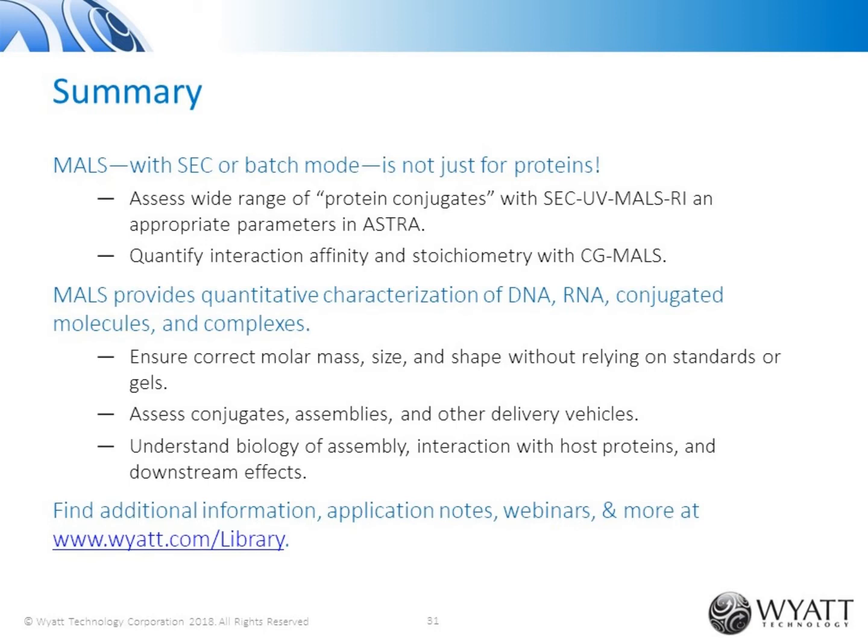We don't have that issue. So ours is usually very consistent with the solution-based techniques like calorimetry or centrifugation. And we'll usually get reproducibility somewhere between 10 to 30%.